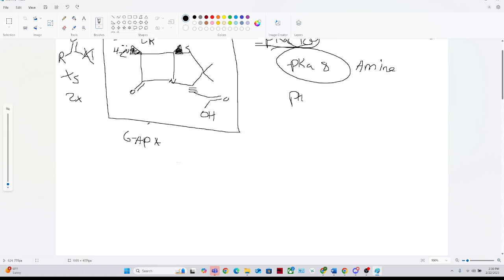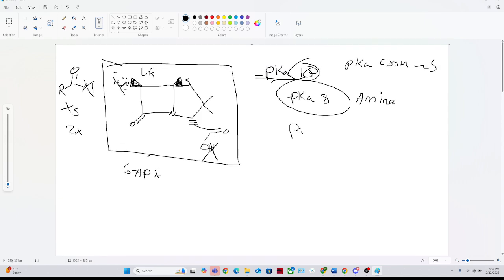But what happens is that once you add that bicarb, you want to now add your 6-APA. This is basically just ensuring, and the sequence, in my opinion, matters. The reason it matters is because if I add my 6-APA and wait a little bit, a neutralization reaction can occur where your OH gets deprotonated, and then after that, sequentially, your amine gets deprotonated.